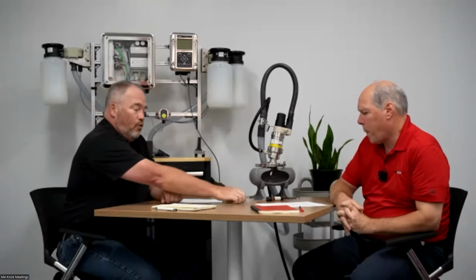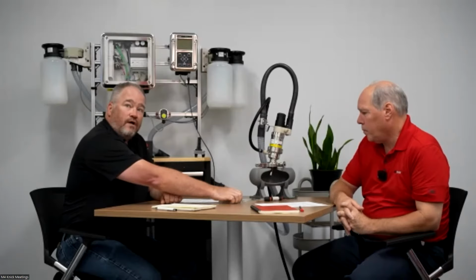Yeah, I mean, again, the probe, which is clearly something that's a consumable, because pH probes have a finite life. So of course, you're going to use that up as it's going through its day-to-day measurements. But then there's the other aspects of operational costs, such as, I think I mentioned, you have a person going out into the field to do calibrations in a static probe installation, correct? And it varies what that looks like from customer to customer.